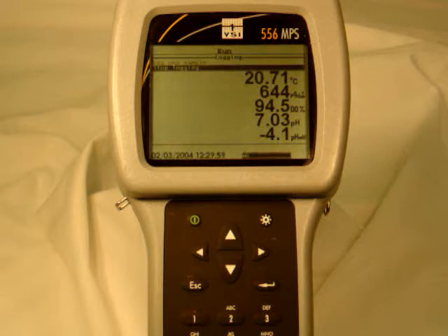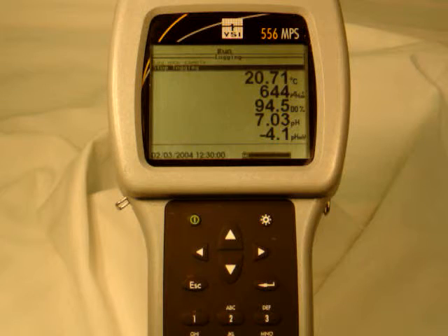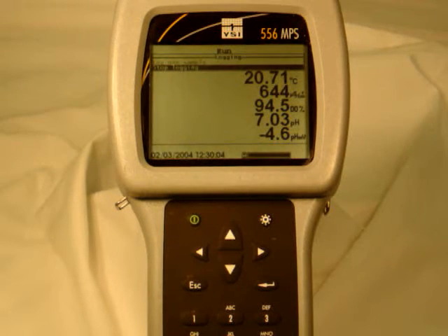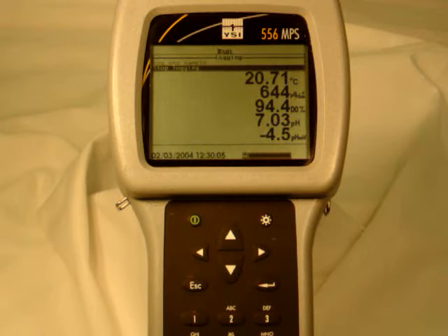Ground loops are... That's stable. Keep going, don't press stop.